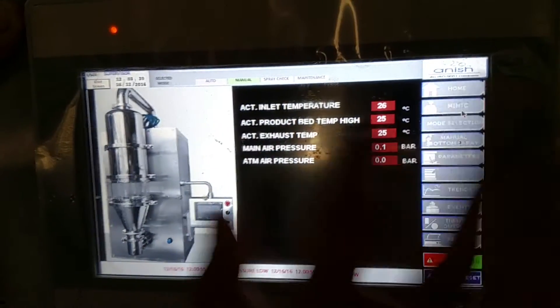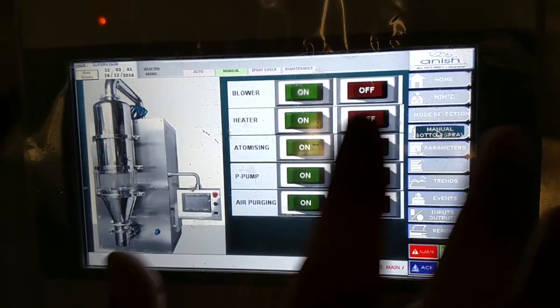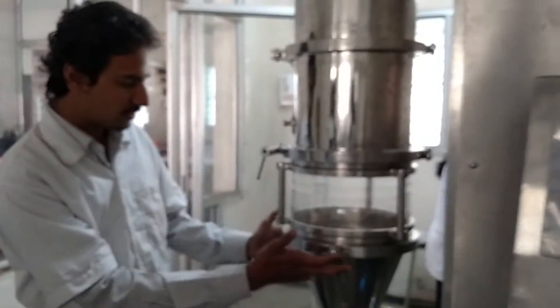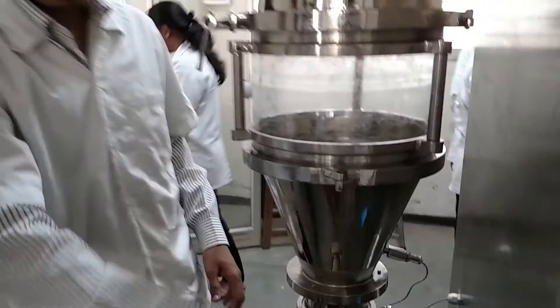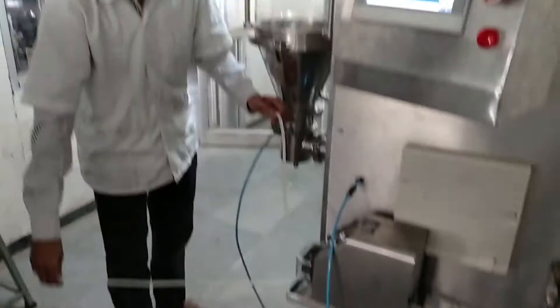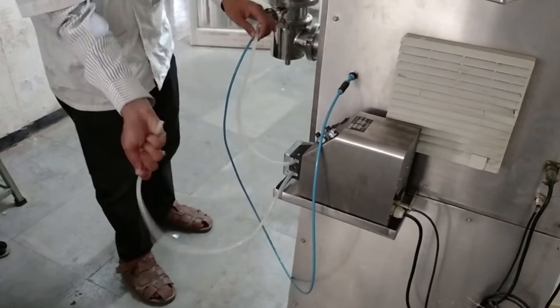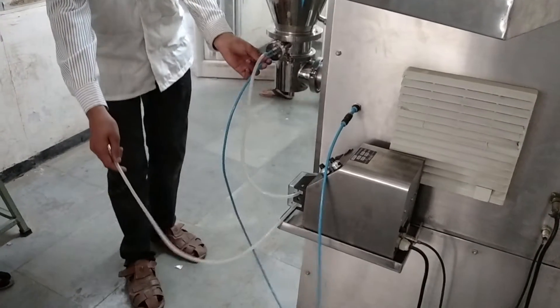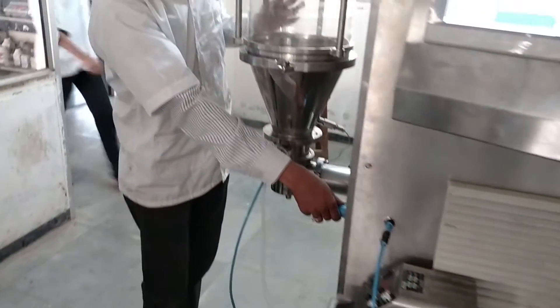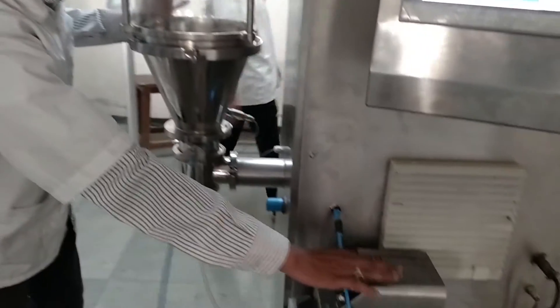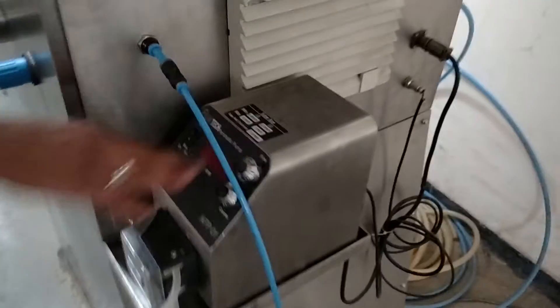Now we will start the compressor, and then one by one: blower, heater, and atomizer. Prior to that, we have added our granules into the system. Here is the knob — from that knob we have opened this system and added our granules into the pot, then reconnected the pot. This pipe is for the coating solution, which will run from this end to this end. This is the atomizer. Here is the knob for controlling atomizing speed. And this is the pump that controls the RPM — the pumping — of the coating solution.